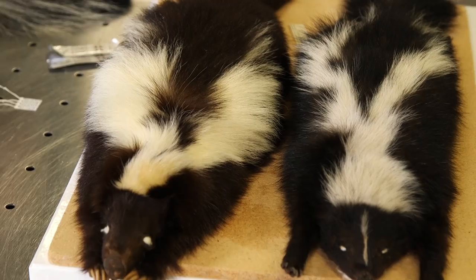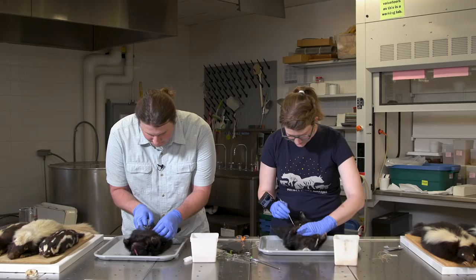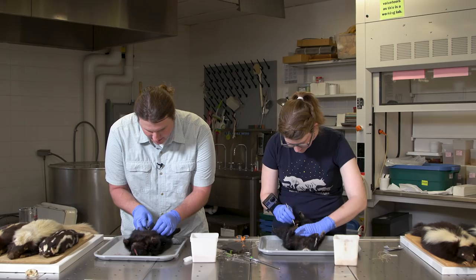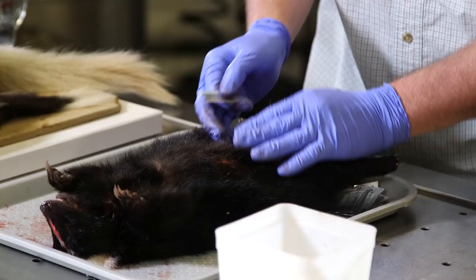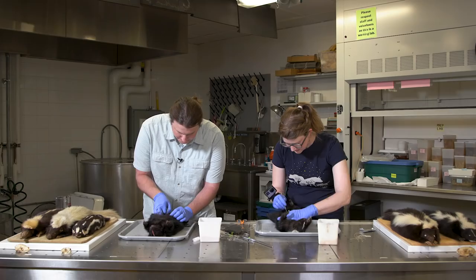This is my first time doing a skunk. The first time I showed someone how to do it, I cut the anal gland while demonstrating. Let's hope we don't carry that jinx again — knock on wood.